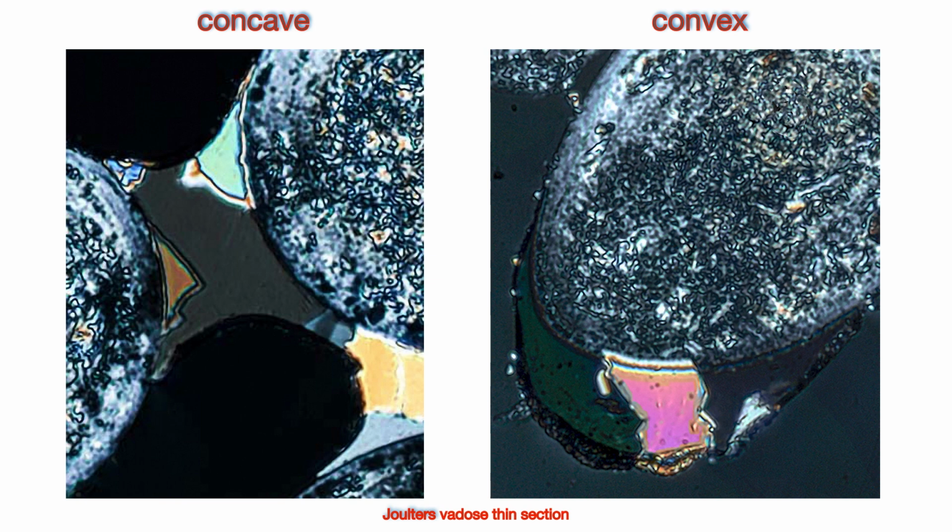Crystals growing up to an air-water interface will have internal surfaces that are concordant with the interface, while crystals that are dissolved will have internal growth surfaces that cut across the crystal's final surface. Unfortunately, the CL images of most intergranular cement crystals examined here reveal no internal growth surfaces.